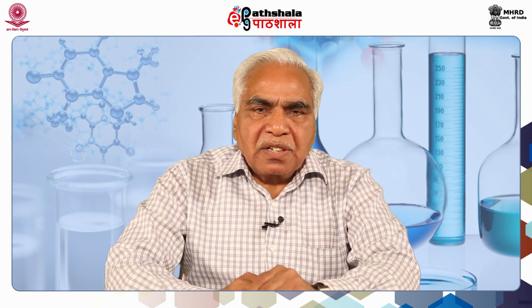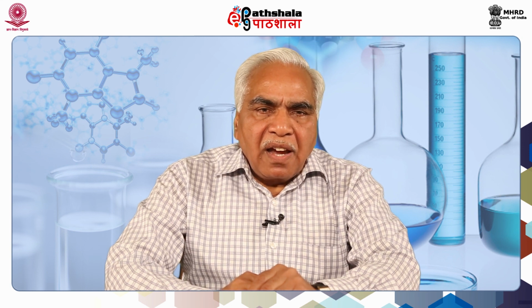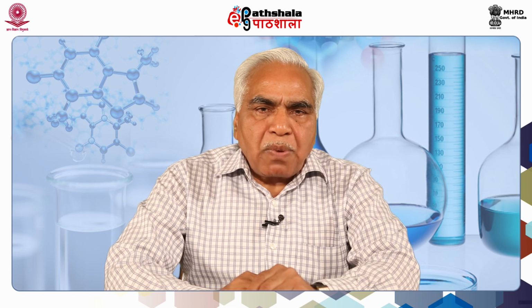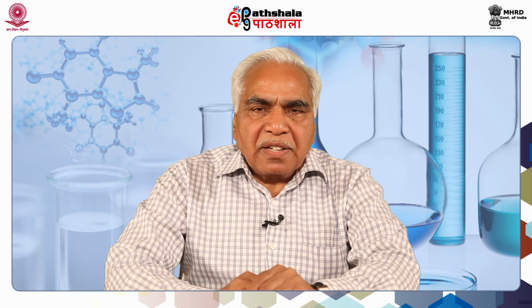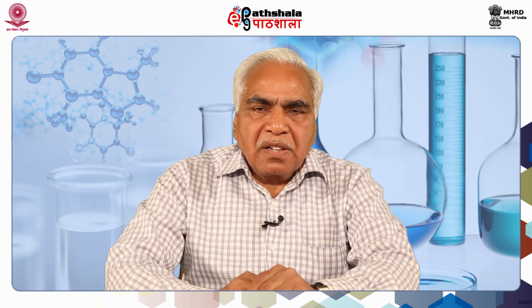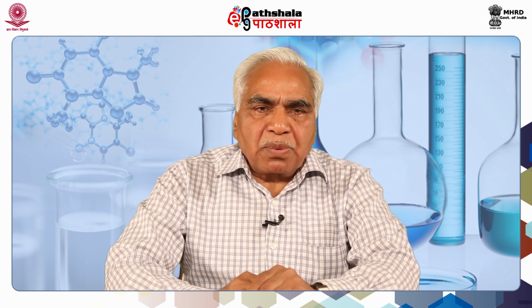We have also discussed transmission electron microscope in separate module. The differences between the technique and the SEM are apparent. In TEM or transmission electron microscopy, electrons which pass through the sample are detected by the detector. However, in case of scanning electron microscopy, electrons scattered from the sample surface are detected by the detector. Transmission electron microscopy can provide information on internal structure of the cell, while SEM cannot.